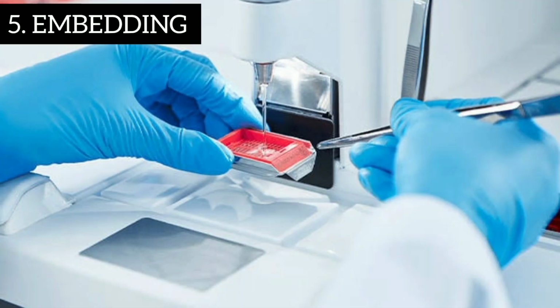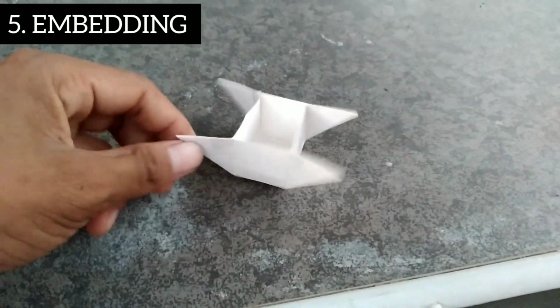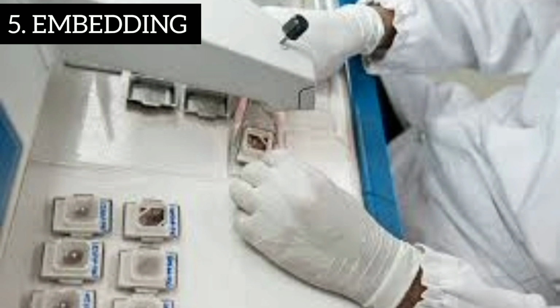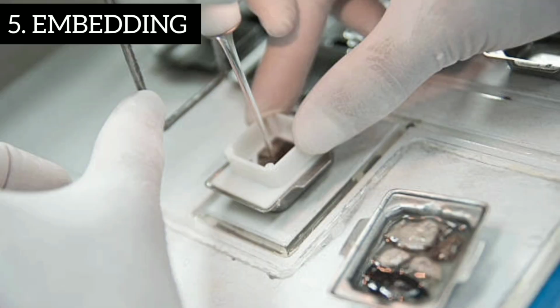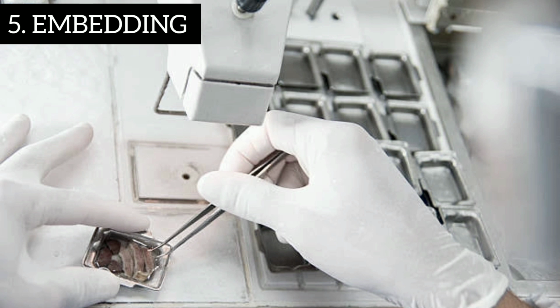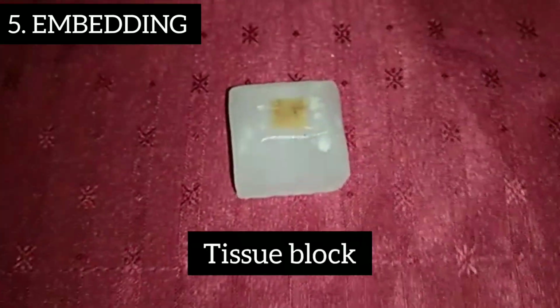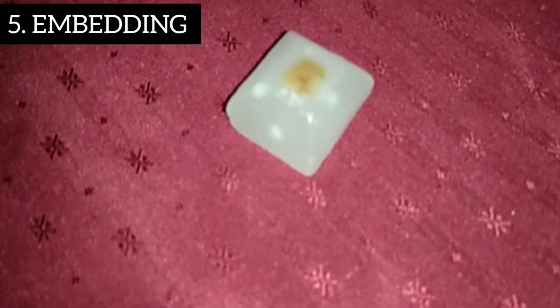Next is embedding. Embedding is the process of forming a tissue block using a mold as a shaping device. A tissue block is formed with the paraffin wax or other embedding media to allow the cutting of suitable thin sections without the unnecessary distortion and alteration of the spatial relationships of the tissue and its cellular elements. This process, after trimming or facing, facilitates sectioning.